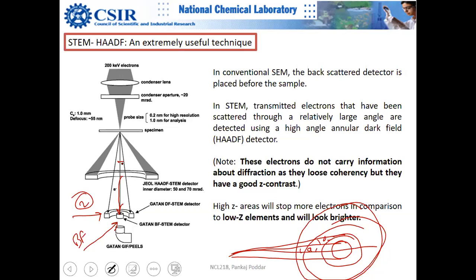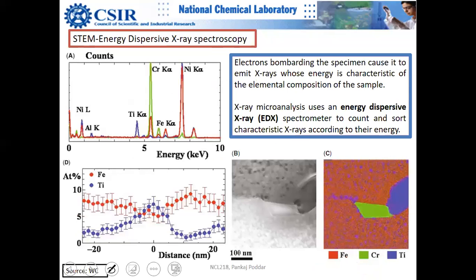Okay, so there you basically tilt the beam. The beam can be tilted actually. So there are some tricks. The beam is basically manipulated, not the detector, because detector manipulation is very difficult. You can't put so many detectors, but you can always tilt the beam easily, and that is done actually.